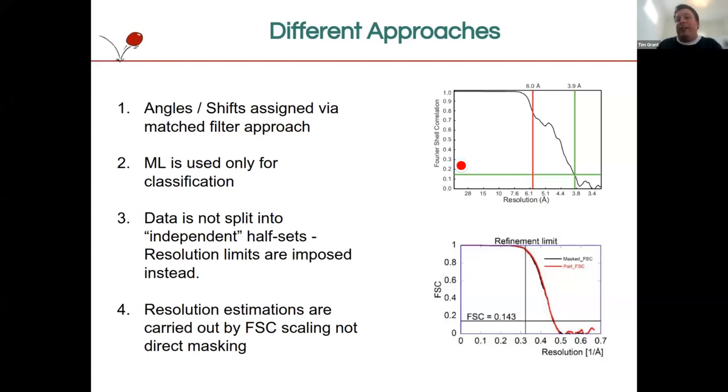What that means is before that resolution, you do have essentially bias built into the map and the Fourier shell correlation. But after that resolution, you have no bias in either the map or the Fourier shell correlation. So as long as your measured resolution is somewhat higher than your alignment resolution, it's kind of believable. It makes it very important what you set this resolution to be, and it makes it very important that you report this resolution if you use published results from system, because otherwise you cannot judge how accurate that may be. So it's an important thing to bear in mind.